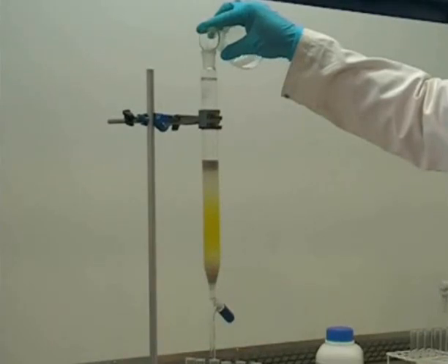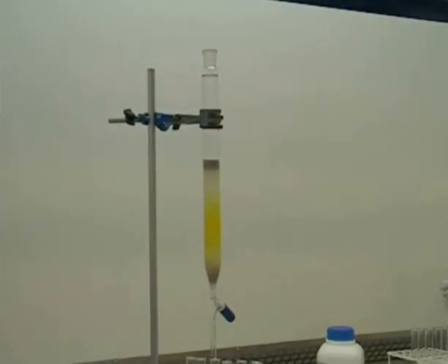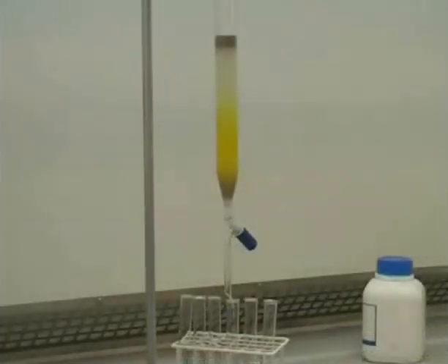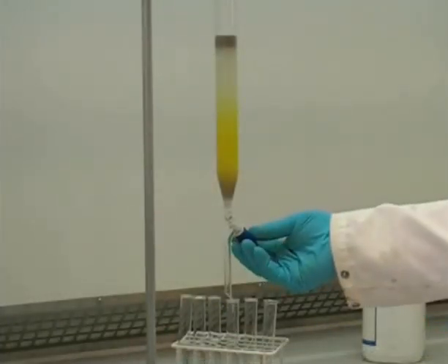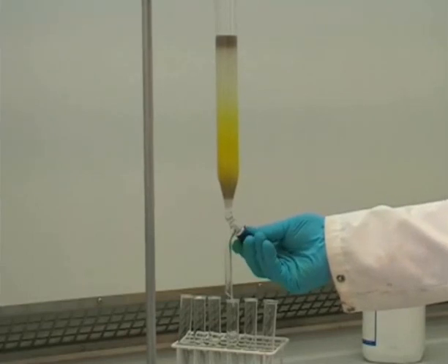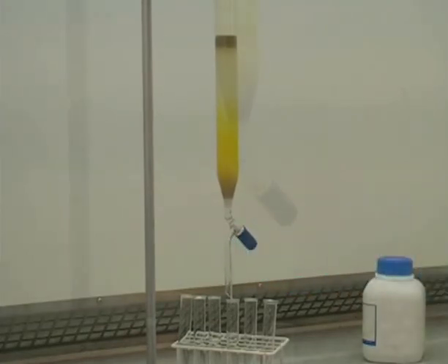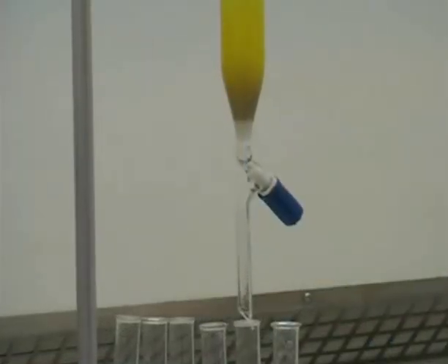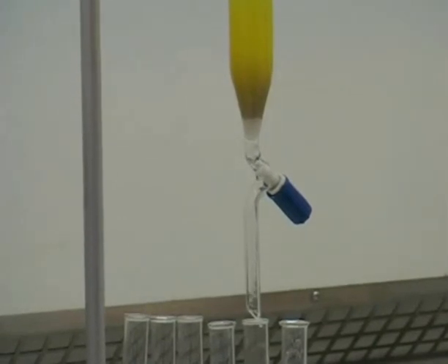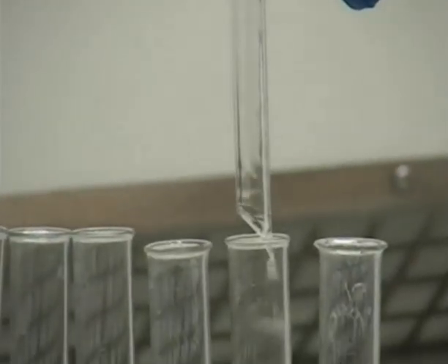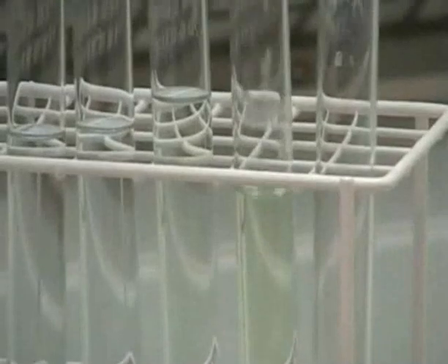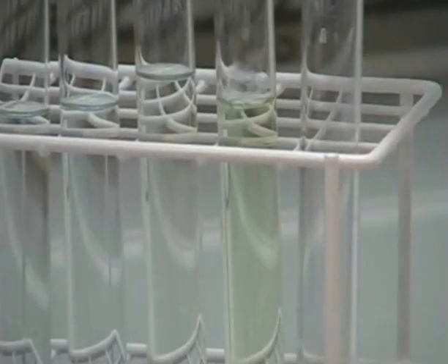And as the level of the eluent approaches the sand, it's important to make sure that you top it up. We can then continue to collect fractions and in this case you can see that the yellow band in the silica is approaching the bottom of the column. If we look closely at this particular fraction, we can see that the solvent has a yellow colour, telling us that our compound is eluting. Of course, in other cases, as mentioned previously, you'd have to use TLC to identify the presence of a compound.